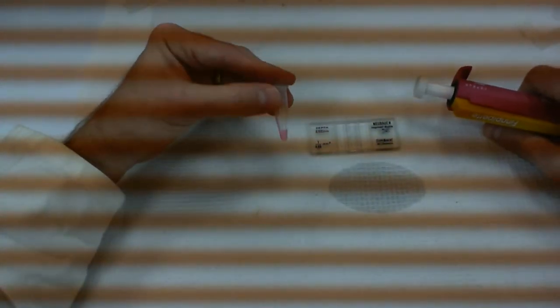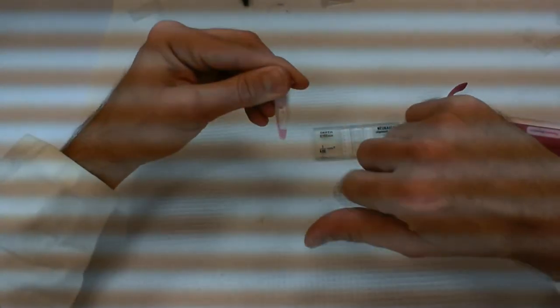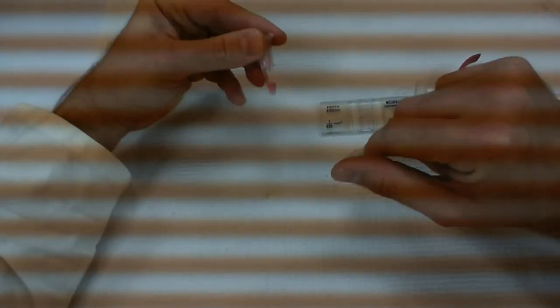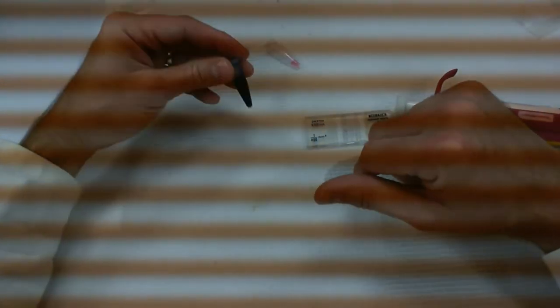To prepare your sample, you have some cell culture here, so you have some cells. Again, make sure you distribute them well before using them. You don't want to have all your cells sitting in a pellet at the bottom of the tube. If your tube's been sitting around for a while, they're all going to be at the bottom. So make sure you distribute them well. And you have some trypan blue.